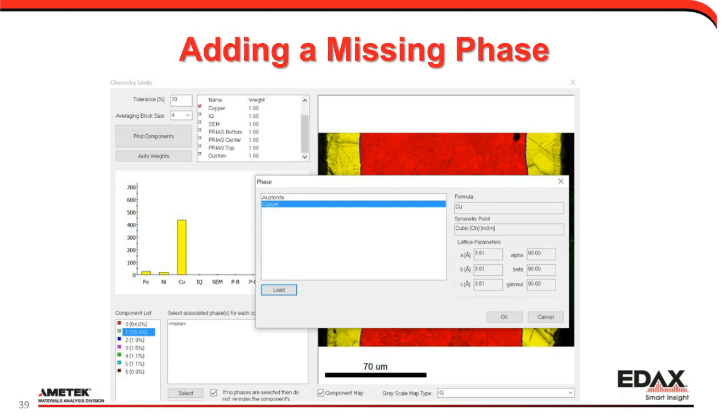Our quantitative method does account for tilt, because again, you're changing your geometry, you're changing your interaction volume, and because of that, it does change how the quantitative measurements are done. So in general, there are additional complications on our side, but on your side there really shouldn't be any. Besides, of course, the count rate issue. Again, you're just not usually collecting that many counts on a single pixel. And if you ever collect an EBSD data set, you can click on it, and you actually get a single pixel spectrum. You're going to see that, again, those can be relatively small.